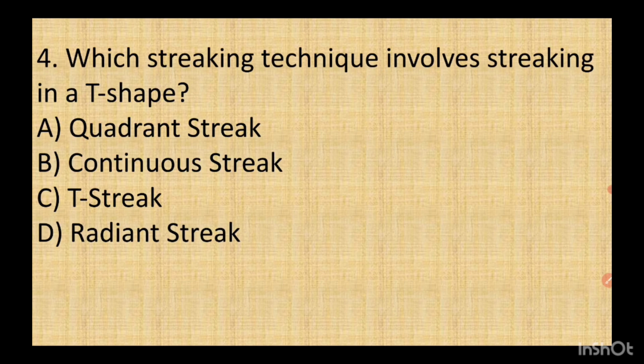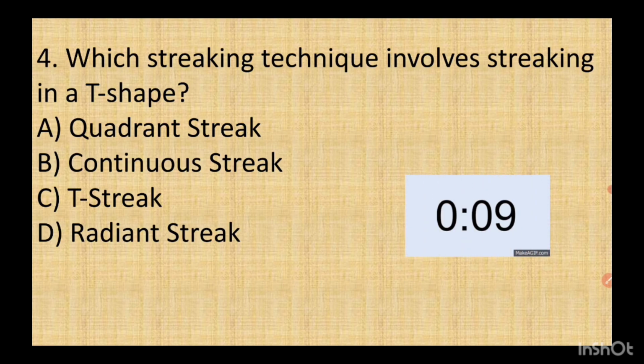Radiant streaking. Which streaking technique involves streaking in a T shape? Answer is T-streak.